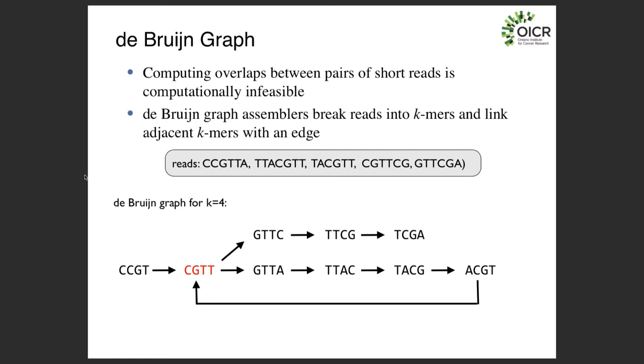Well, it depends on your reads, right? Because if, for example, the upper row also starts expanding. Yes. So if they're sort of nested reads, it can keep expanding, but in an overlap graph the number of edges grows quadratically with the repeat copy number. In this graph, each repeat copy gets collapsed down to single nodes, so it grows linearly with the repeat copy number. So it has a much better growth structure than for overlaps.